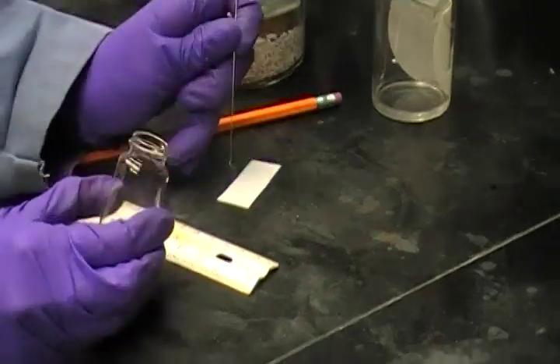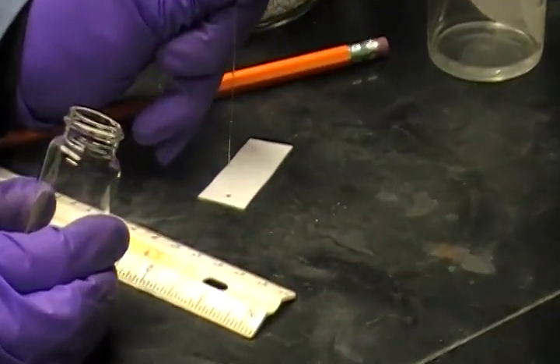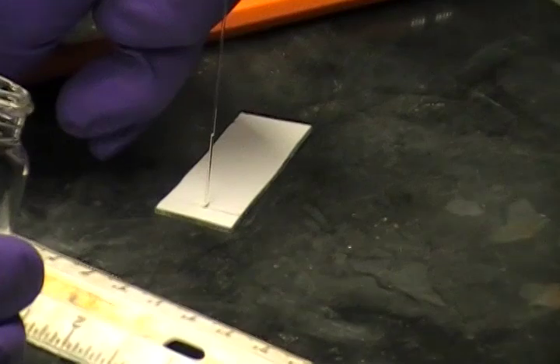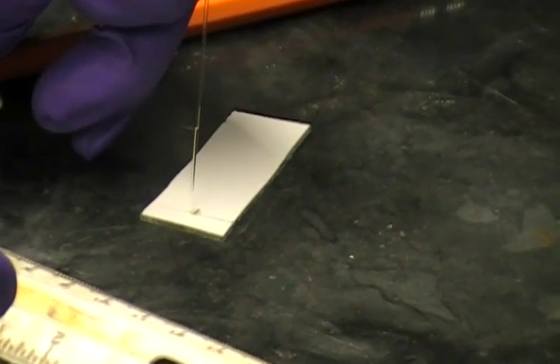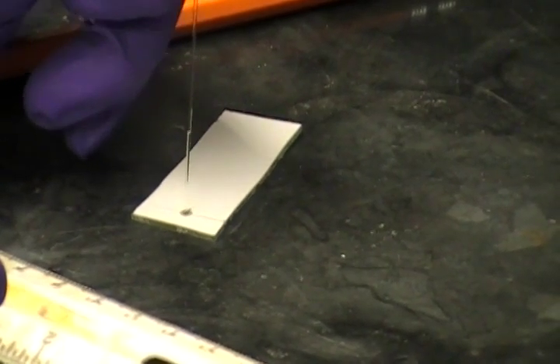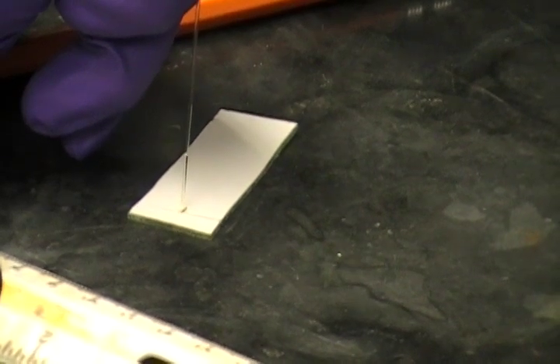Now we use a TLC spotter to transfer our desired sample onto the plate. The capillary action draws our sample into the TLC spotter. We lightly tap the spotter onto the plate to make the smallest spot possible. If your sample is concentrated, one spot will be sufficient.